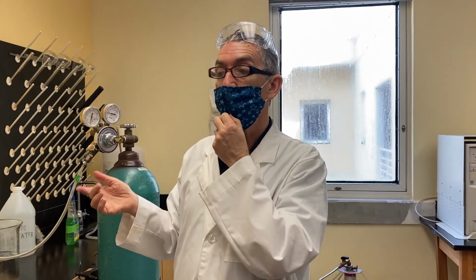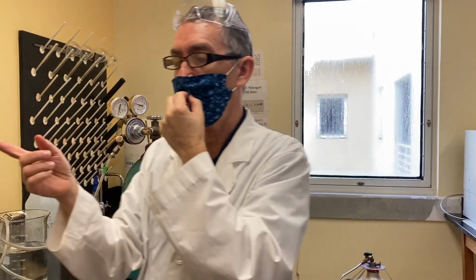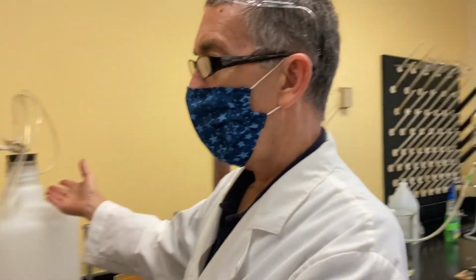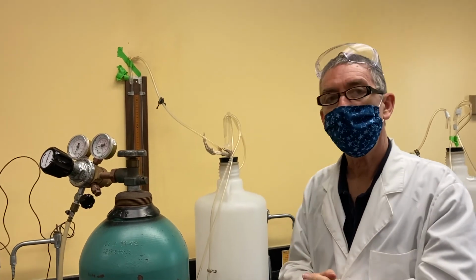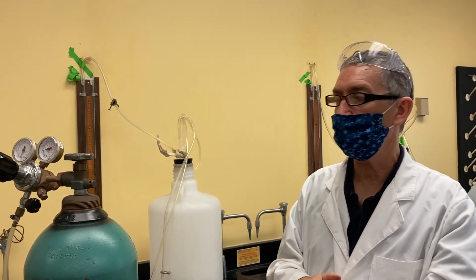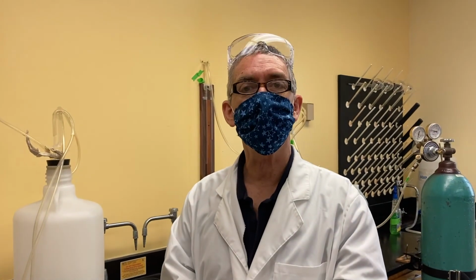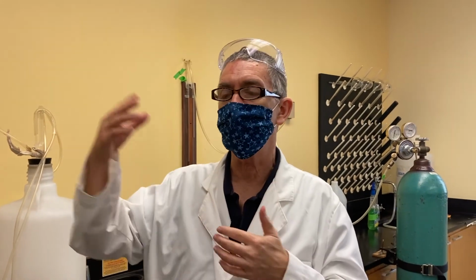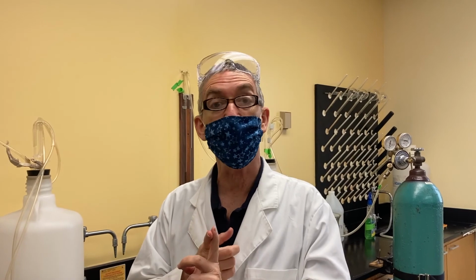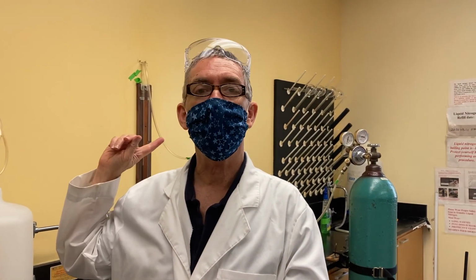And then, if you're in partners, you can switch. The person doing the observing can now do the run and vice versa, and just do the other gas, nitrogen. Very same procedure, and you'll get then a good 5 data points, we hope, on each of your gases, and that will conclude the experiment. Okay. This will not be the end of the videos. There will be a couple extra videos, one on reading a barometer and one on operating a gas regulator.